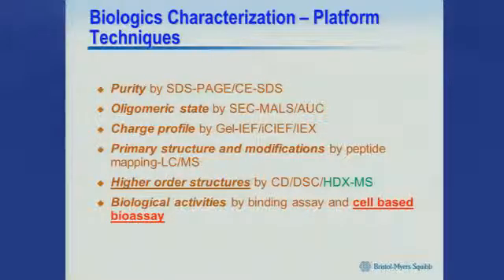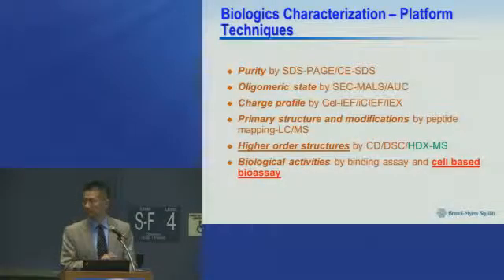So you need to have cutting-edge technology and also take advantage of platform techniques. For example, imaged capillary isoelectric focusing nowadays is almost the norm. About 10 years ago, really not many people were using it. And Genentech is one of those companies that really pushed forward and used capillary-based techniques. And pretty much everybody's using it now. In addition to that, some other techniques like HDX MS, Hans already talked about it. We already use it regularly in our comparability studies. And those are the things that we really pay a lot of attention to.